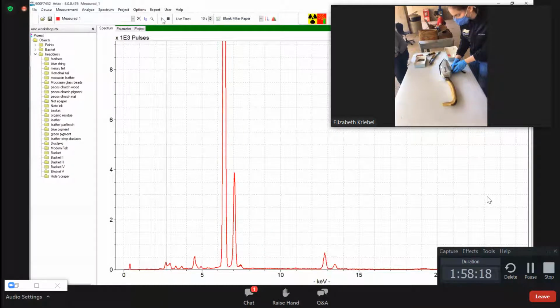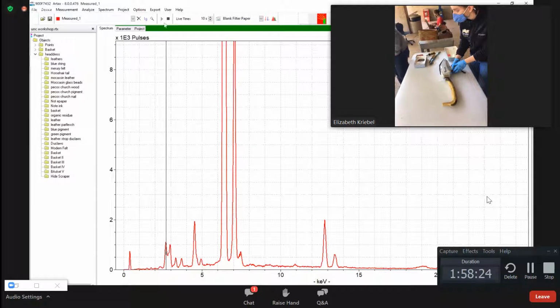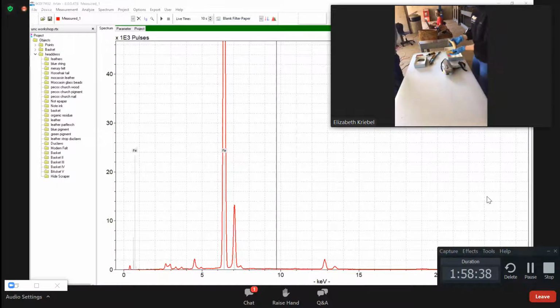There we are. So this is not a modern nail. This is just a piece of iron. Yeah, so this has rust potential. We do not want this near moisture. It's just iron. It's not stainless steel. No, I'm saying iron. If it's steel, you would obviously have some carbon mixed in, but that would be invisible to us.